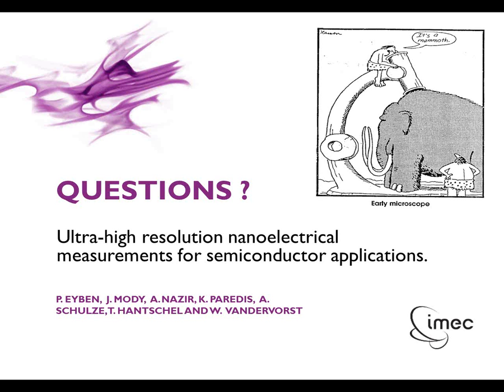You need very sharp tips that are not presenting any double tip contact, so also measuring in low humidity conditions. And you can get it only if you measure on a very nicely prepared and flat surface, and also not a scan of about 10 microns, but a small scan size. So clearly, these kinds of resolution you can reach in ideal conditions.